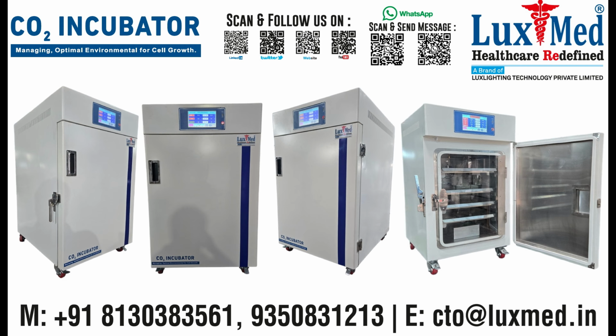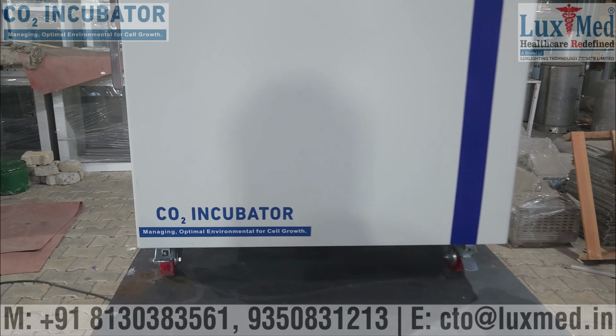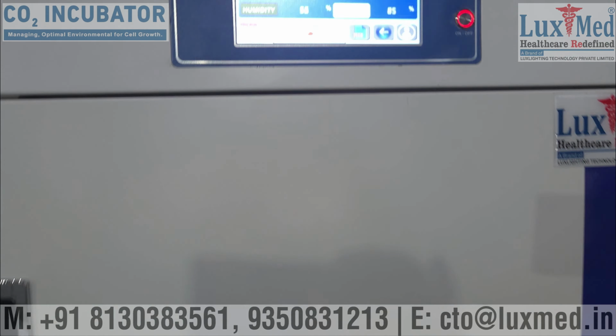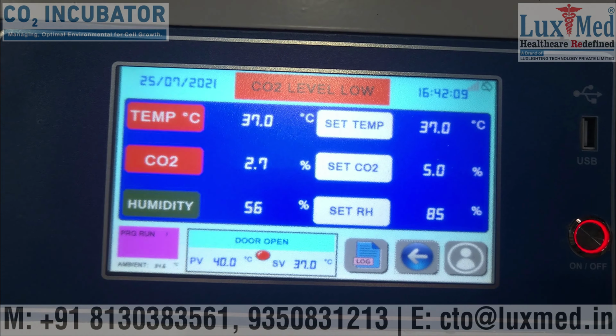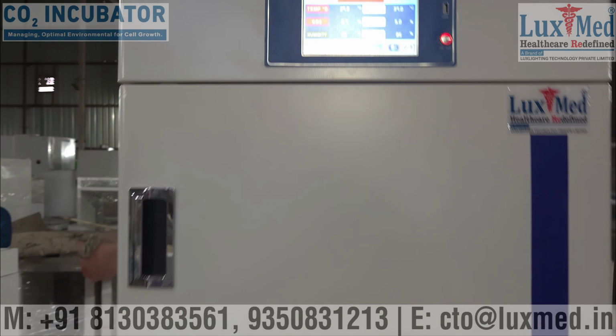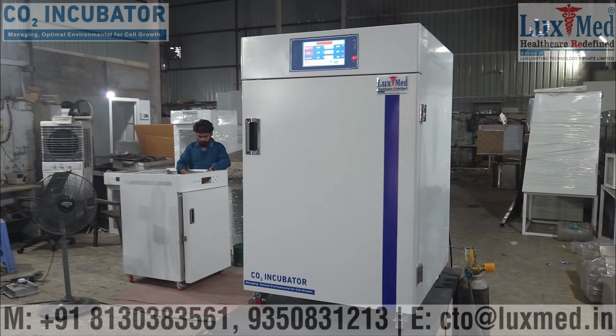LuxMed CO2 incubators are essential laboratory equipment used to maintain optimal conditions for cell and tissue cultures. They provide a controlled environment with specific temperature, humidity, and CO2 levels to promote cell growth and survival. These incubators are crucial in various applications, including cell-based research, drug discovery, and even in vitro fertilization.